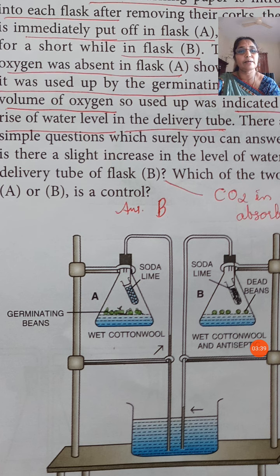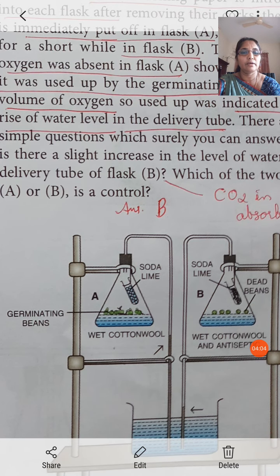In flask B, we can see a small rise in the water level in the delivery tube. This is because the soda lime absorbs the carbon dioxide present in the flask. That is why a small rise in the water level in flask B can be seen.